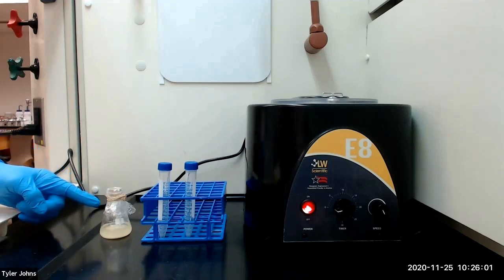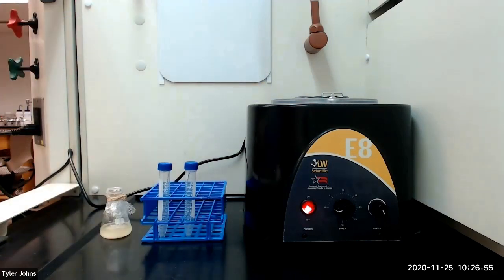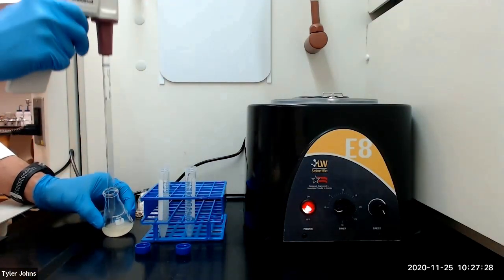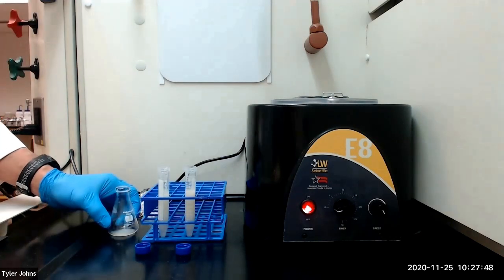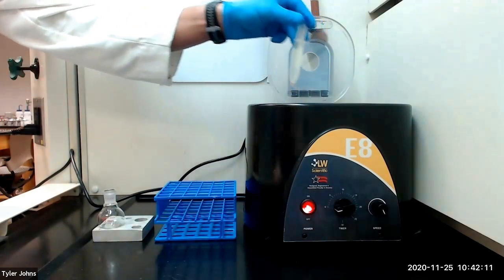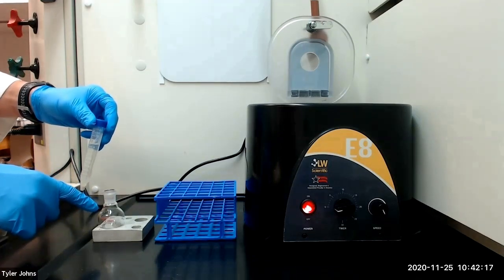After allowing our solution to ferment at 30 degrees Celsius for one week, we will transfer the solution in two equal portions to two centrifuge tubes and remove any sediment by centrifugation. After centrifugation, we will decant the liquid from the centrifuge tubes away from the solid and into a 25 milliliter round bottom flask.